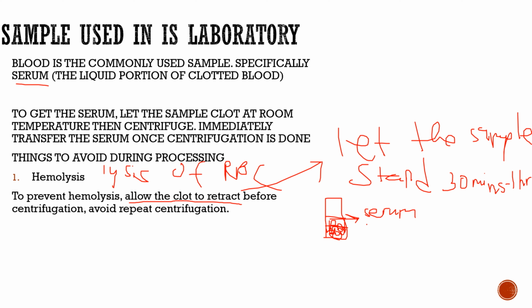May mga laboratory sa probinsya, class, ang ginagawa nila, ini-stand lang nila yung specimen. Wala kasi silang pambili ng centri. Yung mga primary labs na maliliit. Pero bawal yun as per DOH. Dapat talaga may centrifuge. Pero in some laboratories, ganyan ang ginagawa nila. Papastand lang nila yung sample nila hanggang magkusang mag-separate yung serum. So let it stand for 30 minutes to 1 hour and then centrifuge.